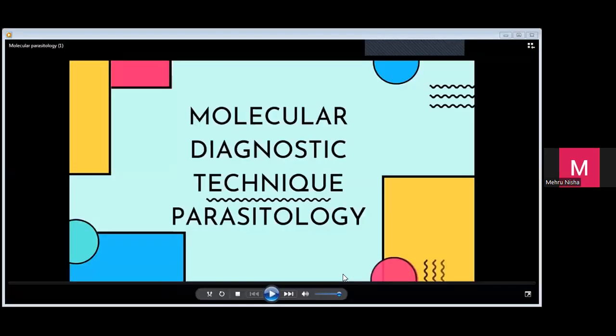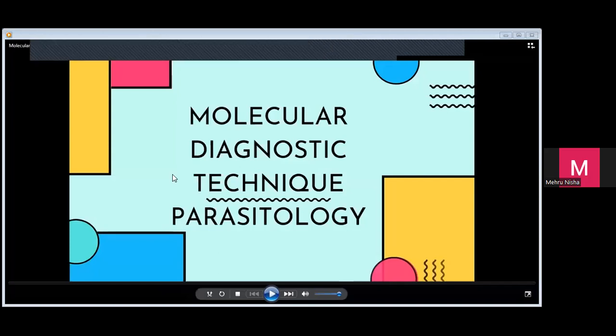Last but not least, let me share with you the video on how we do a DNA extraction. Can you all see this? Yes. Okay. So I will explain verbally, because in the video I think Nadia didn't talk much, but I'll share it here.